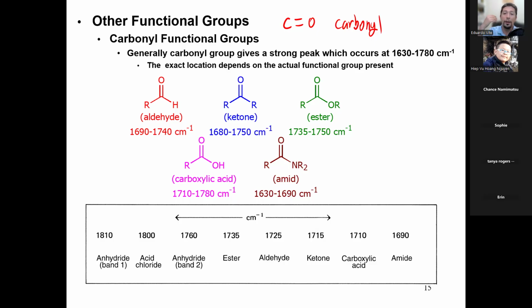Well, when you're talking about a carbonyl, you need to tell me this is a carboxylic acid carbonyl. This is an aldehyde carbonyl. This is a ketone carbonyl, right? Think of the carbonyl like the last name. Like, who are you? My name is Esther, Esther carbonyl, right? You need to be specific. They each have their own wave numbers because they each have their own polarities.